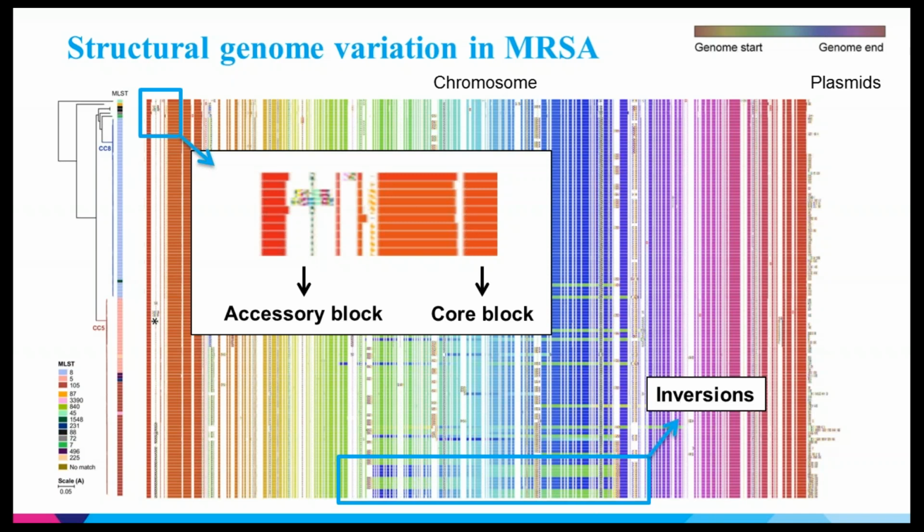And this is the kind of result you wouldn't normally find in Illumina data unless you make very large mate-pair libraries, because these prophages are 40 kb in length. So it's really hard to get through those and to scaffold through those, and you really need long read data to be able to do that.